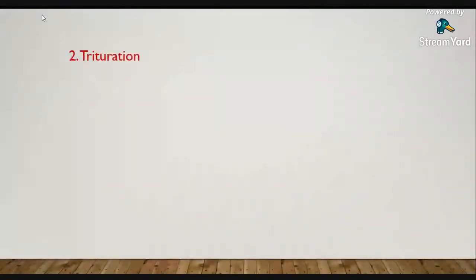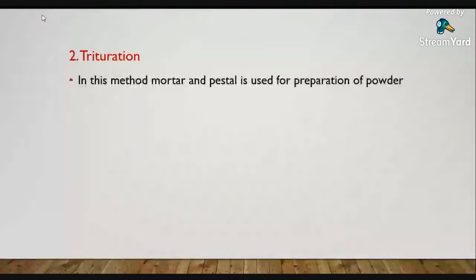Now we'll see the second one, trituration. You also heard about trituration. We are using this method many times in the laboratory, and this trituration process we perform by using the mortar and pestle.